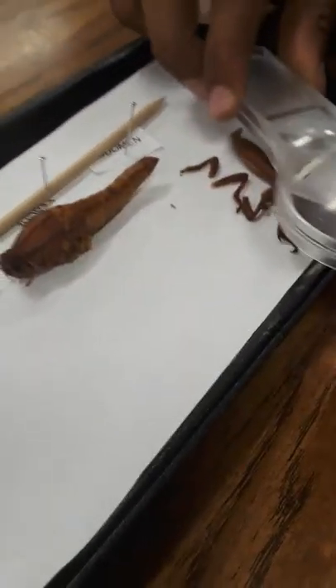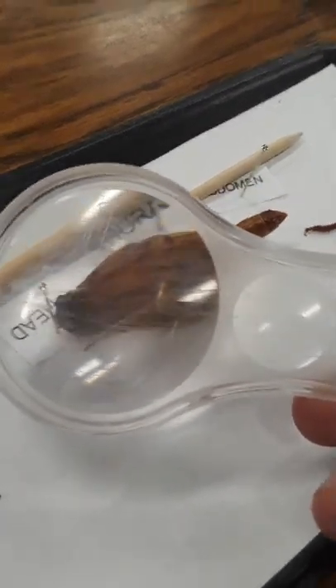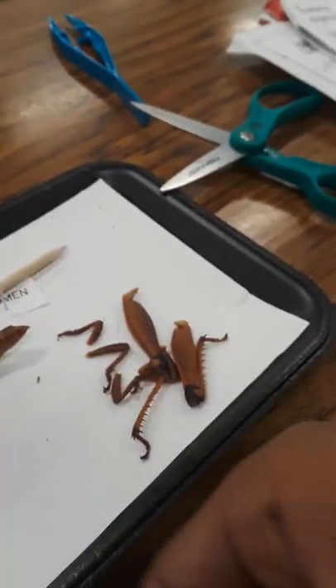Look at that, guys. I hope you guys hear me. What the? Man. I'm posting something. See that? We just cut out all the legs.